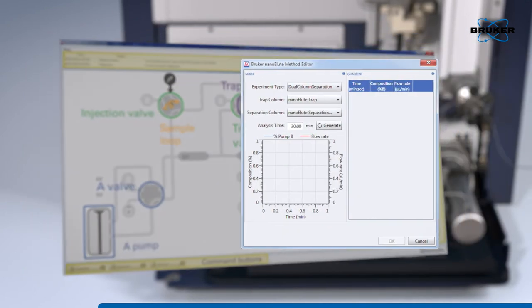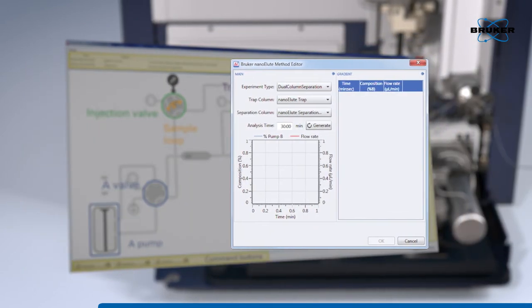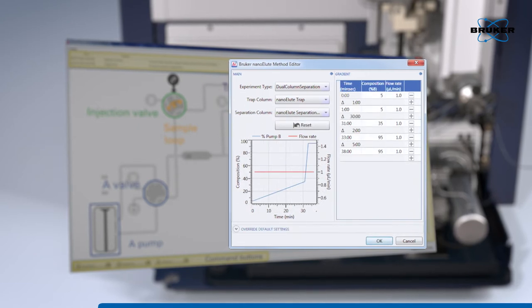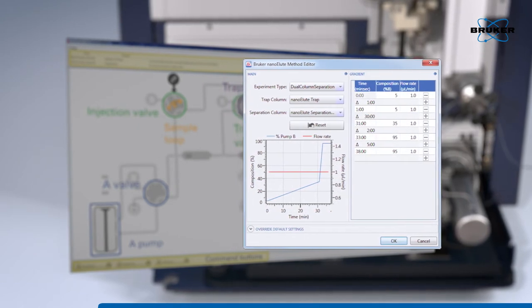The fully integrated and intelligent software control extends instant expertise to cover trouble-free chromatography.